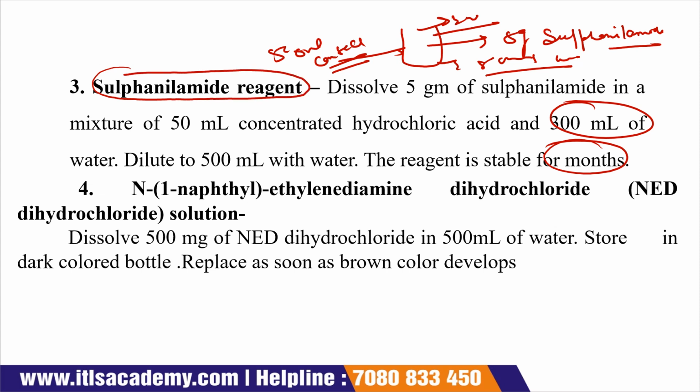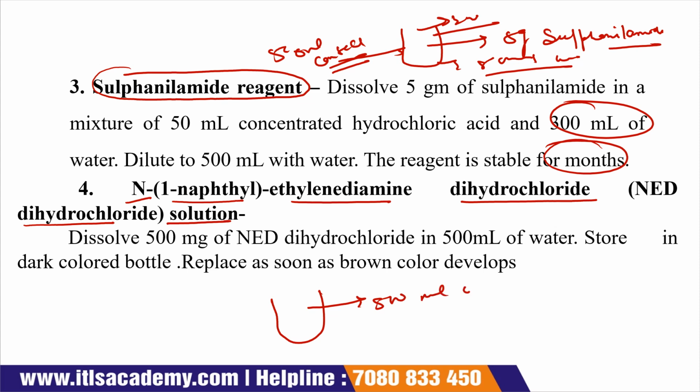Okay, the next reagent that we require is N-1-naphthyl ethylenediamine dihydrochloride, also called NED dihydrochloride solution. For this we require 500 ml of water.